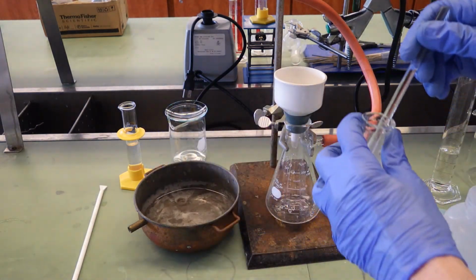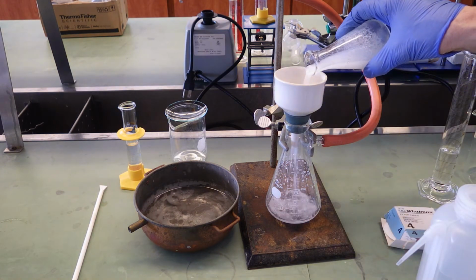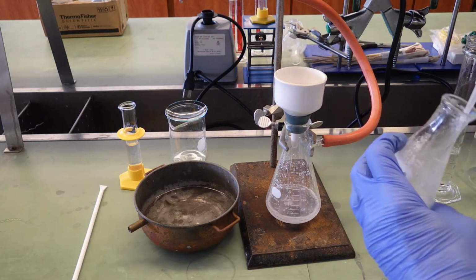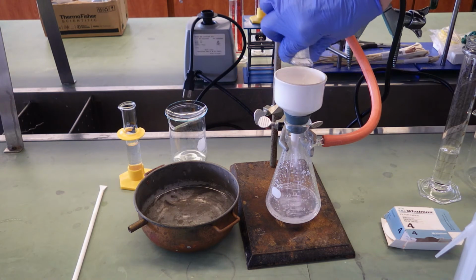Remember that when you pour a slurry onto a filter paper, pour as quickly as possible without spilling so you cover the entire surface of the paper with an even bed of solids. You don't want a cone in the middle. That won't wash well. Likewise with your rinses, try and cover the entire surface if you can.